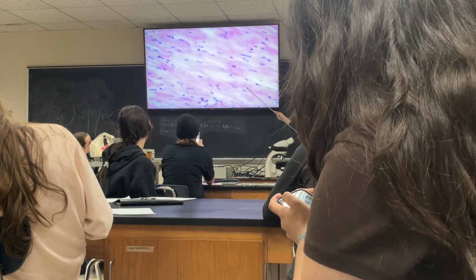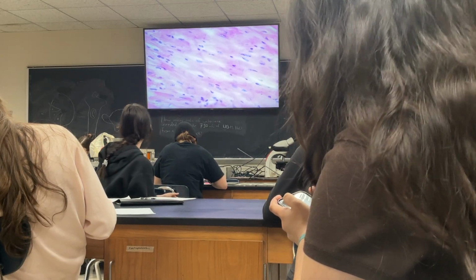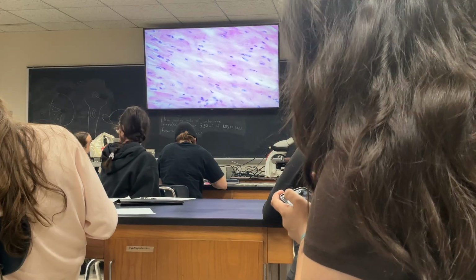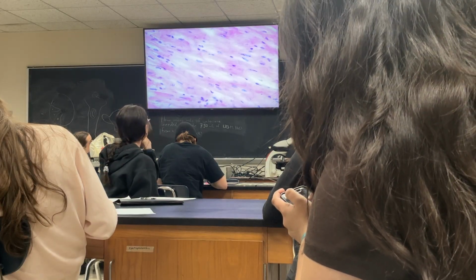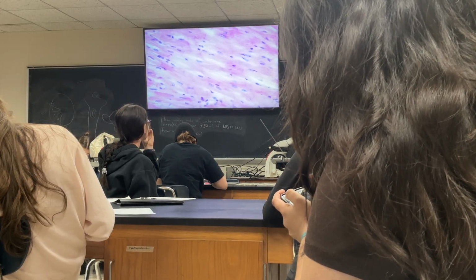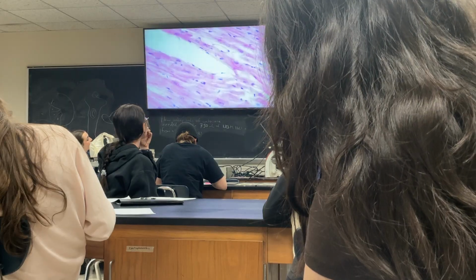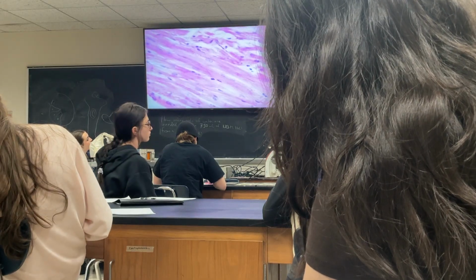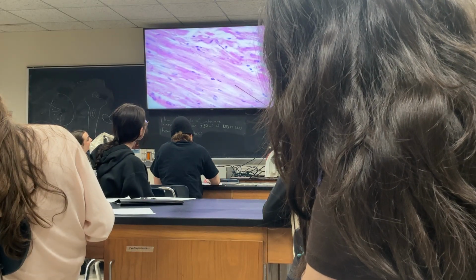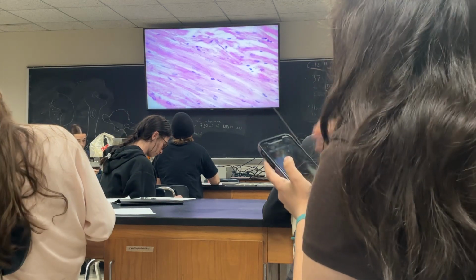Those vertical lines, those are intercalated discs. If you can find a cardiac slide, I haven't been lucky so far, but there's several up there. If you can find a cardiac slide that has clear intercalated discs, that would be really great for drawing, because that's what I'll try to find for the practical, one that has crisp ones. There's an intercalated disc. Now you can actually see some striations. This is the best example we've seen so far, what I mean by those clearings.